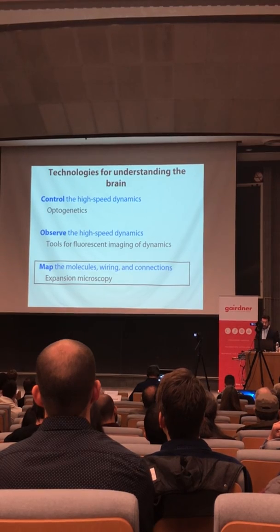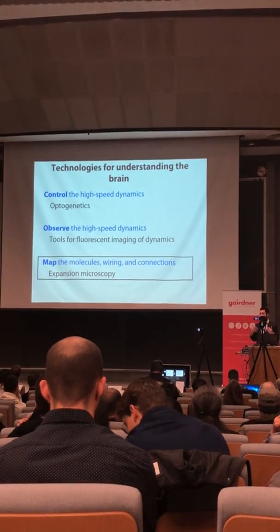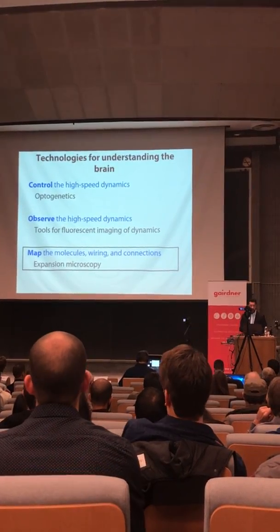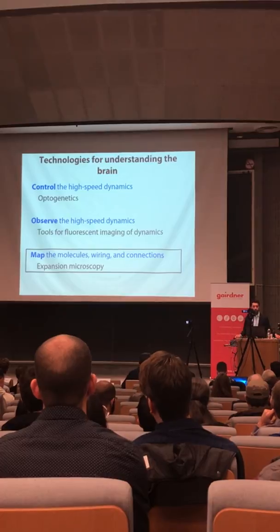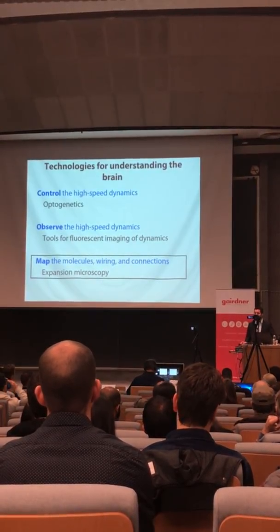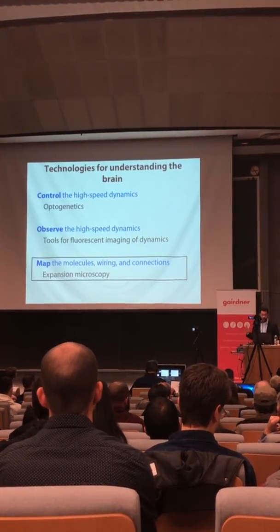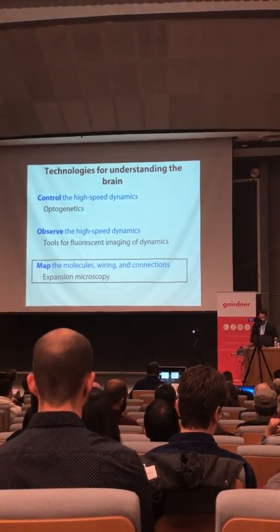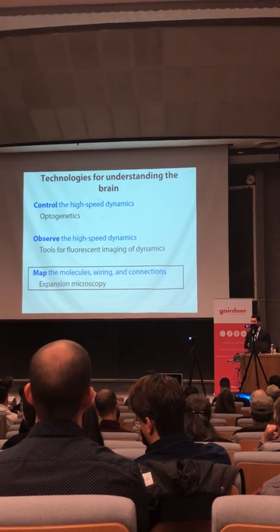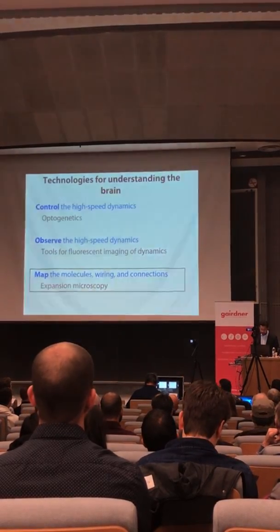So just to wrap up, we really are excited about this idea of nanoscale imaging that can be done in a highly scalable way, and also that can be done with existing hardware so that people can use these tools. A big theme of what we do is to try to think of tools that are easily deployable into the field. A lot of that depends upon performance, but also ease of use. And a theme of all the different technologies that we try to explore is indeed that biology, which is a very democratized kind of endeavor, should benefit broadly from these kinds of technologies.